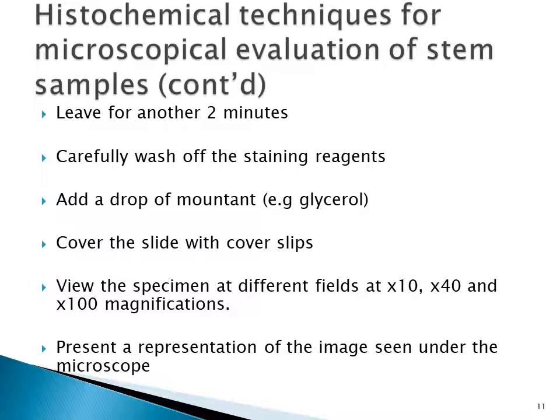After washing the staining reagents, you add a drop of your mountant. In the lab, we usually use glycerol. Then you cover with your cover slip.